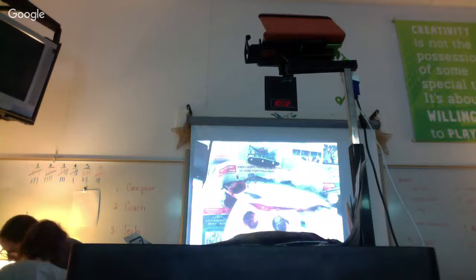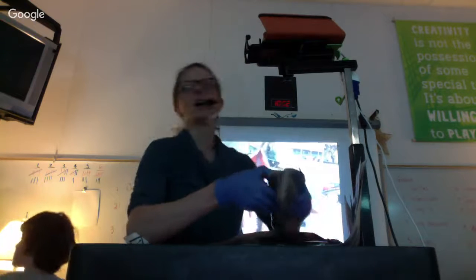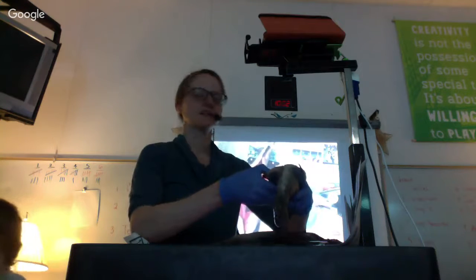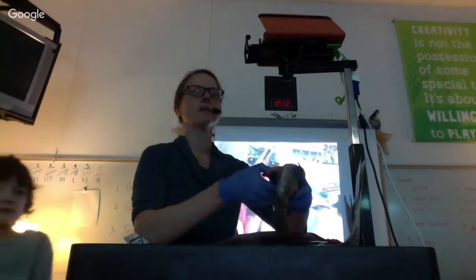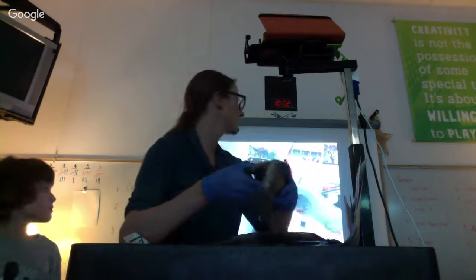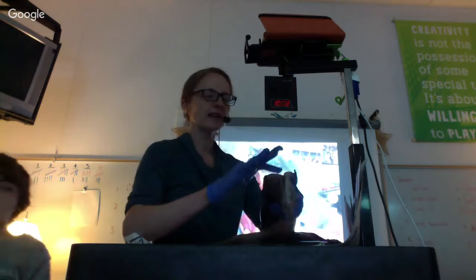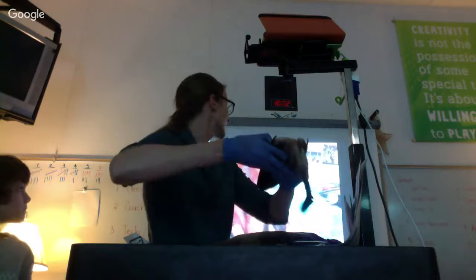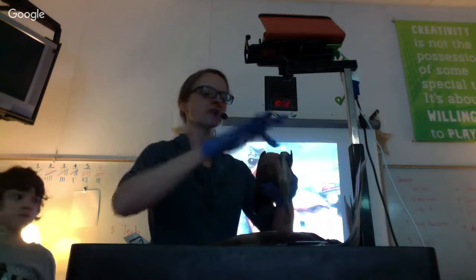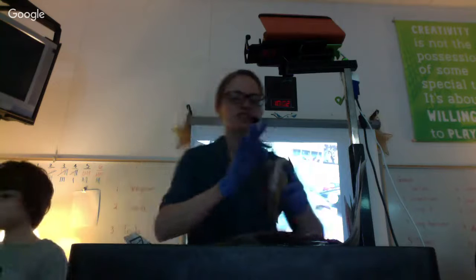I'm going to go to the next one. Can I get everyone's attention for a minute? 5, 4, 3. Just very quickly, because I want to point out something before we continue. 3, 2, 1, and 0. So I just opened Salmon Surgeons. And what happened is their air bladder, and you can see that right here, is still full of air. And that's why you have to be very careful when you're using a knife or scissors that you're not puncturing, because we're going to use that air bladder to have it float in a container. So we want to make sure we're just gentle with that, okay?